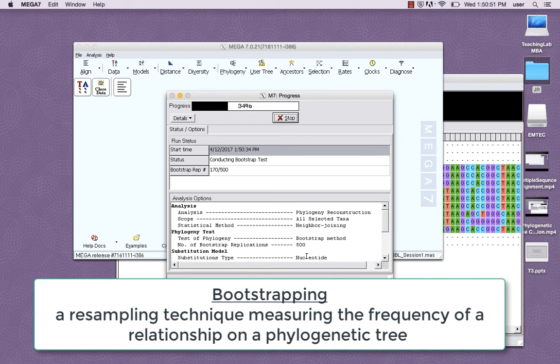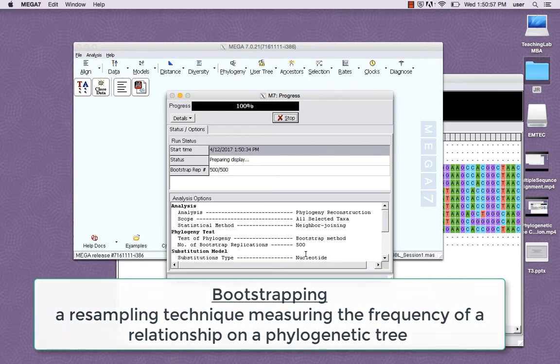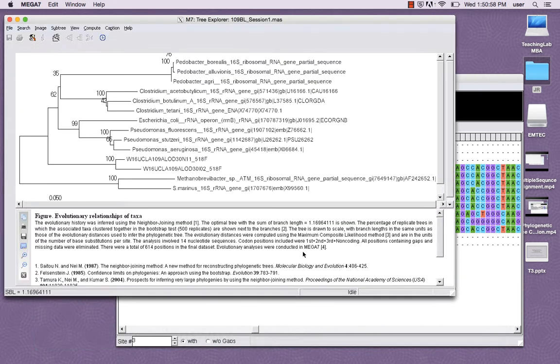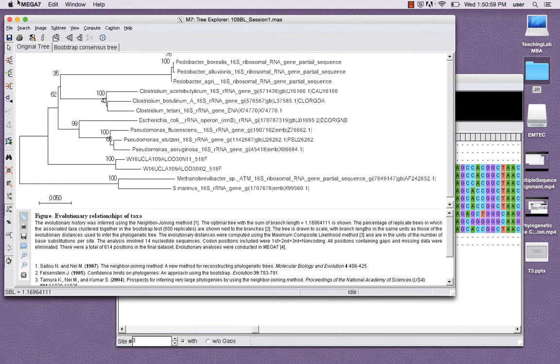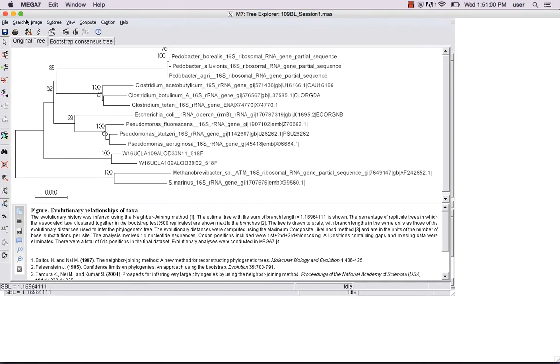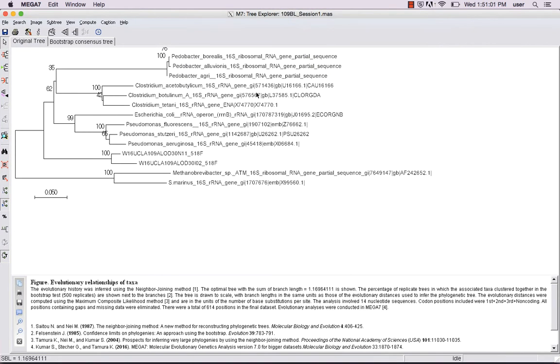At this point, MEGA will be using the bootstrapping method to calculate a measure of how often a bifurcating event occurs at each node of the tree among all of its replicates. The output is a phylogenetic tree, where you can measure the evolutionary relatedness among sequences using this key.